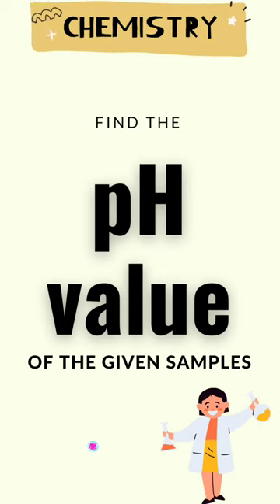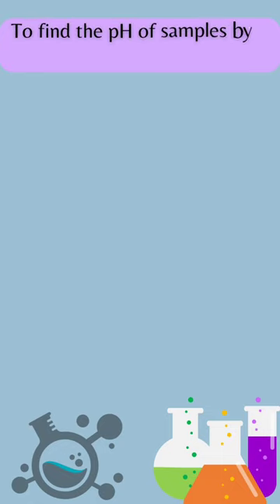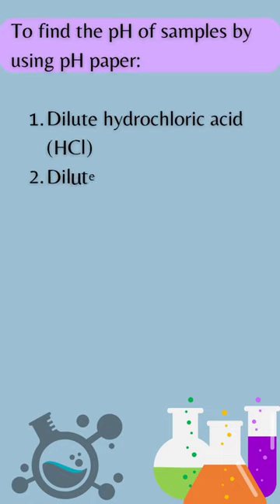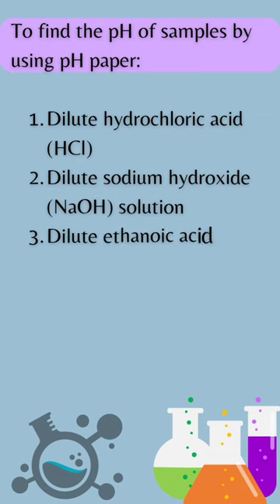Let's know how to find the pH value of the given samples. The aim is to find the pH value of the samples using pH paper. The samples are dilute hydrochloric acid, dilute sodium hydroxide solution, dilute ethanoic acid, lemon juice, water, and dilute sodium bicarbonate.